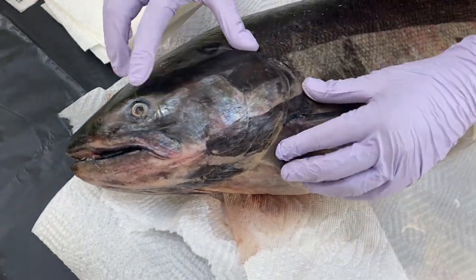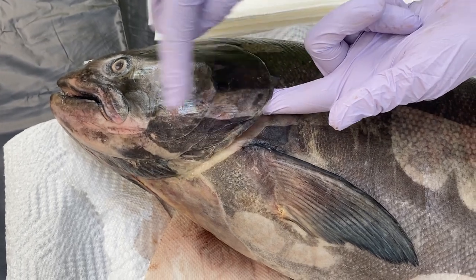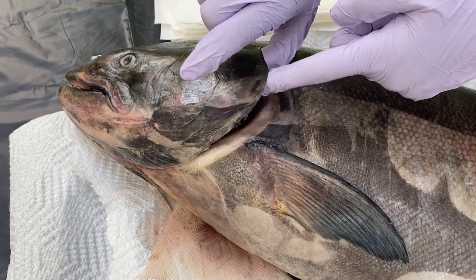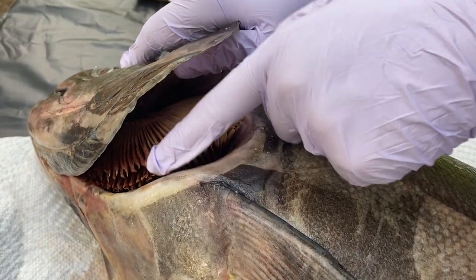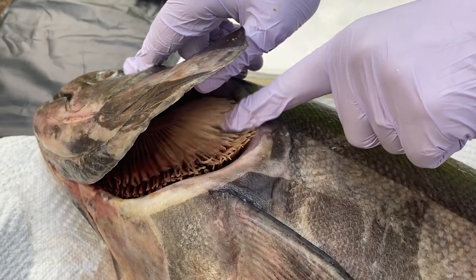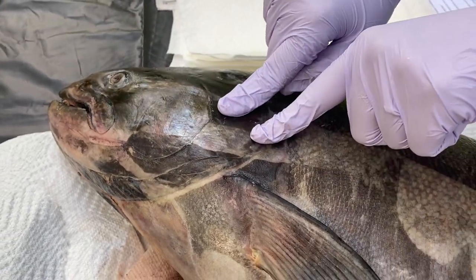And we have this flap right here, and it has a hard bony structure. This is the operculum, and the operculum is just another name for a gill cover. And so we can look inside and we can see all of these hair-like structures. And these are the gills, and actually these really soft parts are the gill filaments. We'll get more into the gills in a little bit.